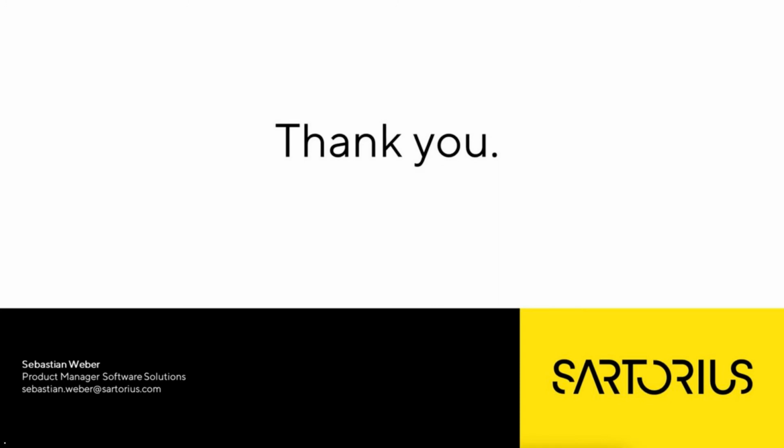I know that we have done tests in our R&D labs where we have had up to 10,000 users on a balance. So there is no restriction really on the number of users on the balance, and it helps because it's all centrally controlled. So no limit.